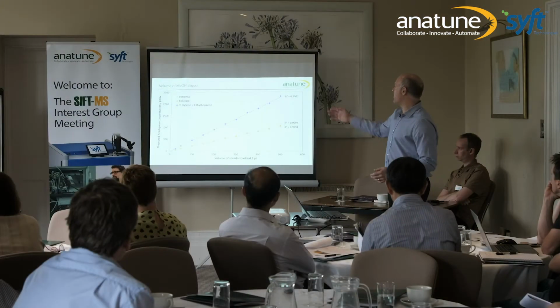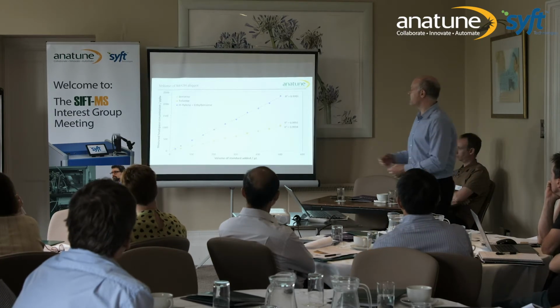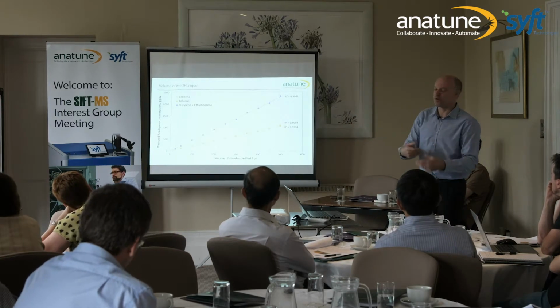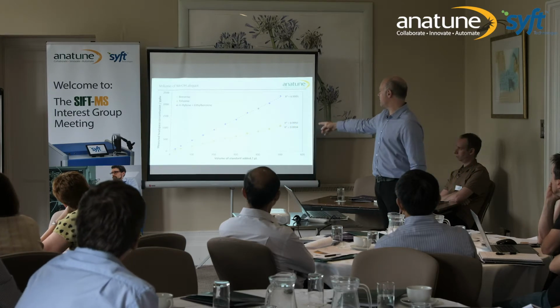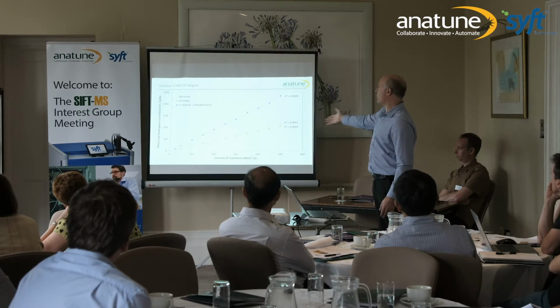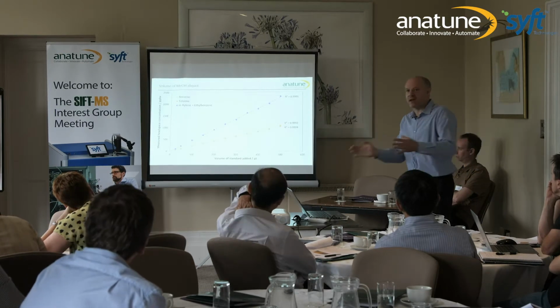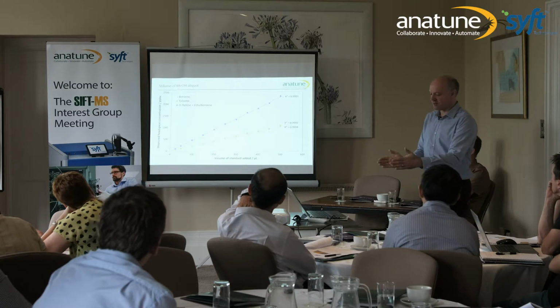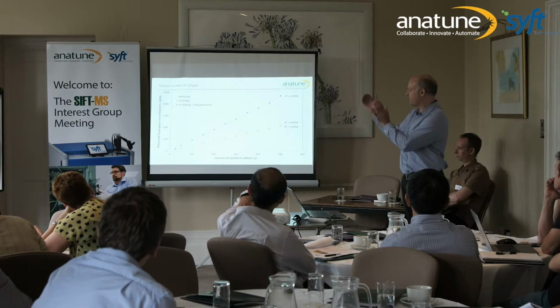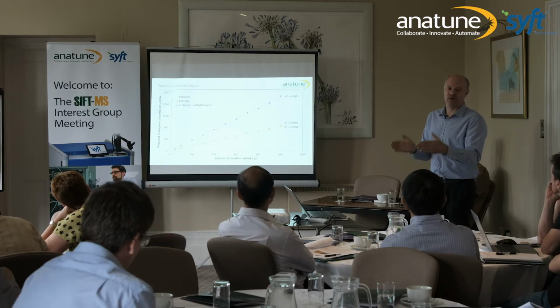So this plot here is basically making a standard up in methanol, and then spiking various volumes of that methanol into the sodium chloride solution from 25 microlitres up to 500 microlitres, and then doing the analysis, checking the linearity. And you can see that, again, we get good linearity, 0.999 plus R squares for all of our analytes. So that does mean we have some scope now to vary our concentration range while still running the same range of the instrument. Just change the spike volume of your methanolic extraction so we can deal with more concentrated samples, and we can deal with less concentrated samples within the linear range that we've shown before.